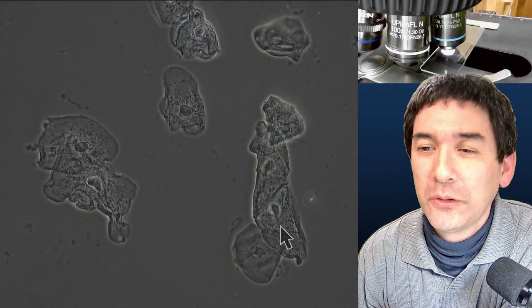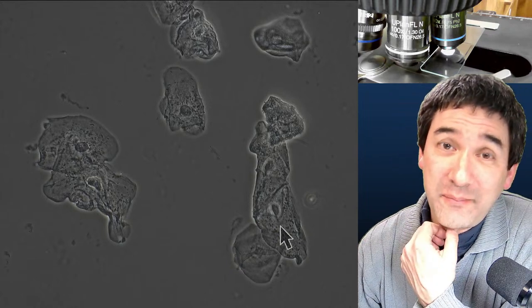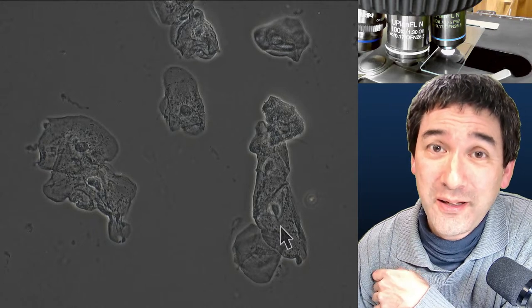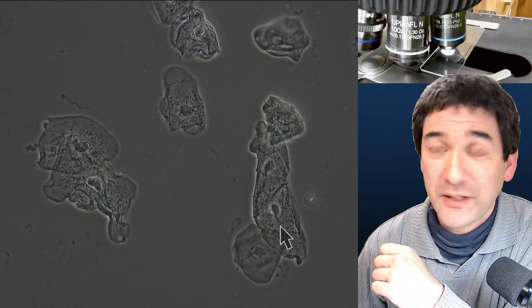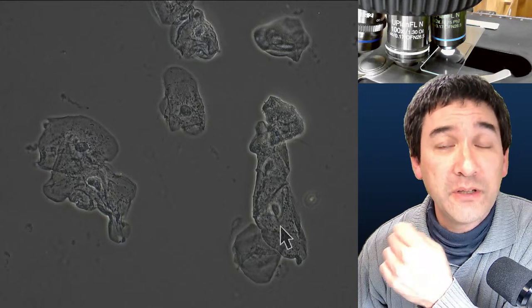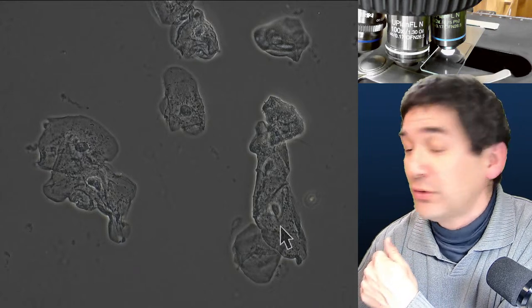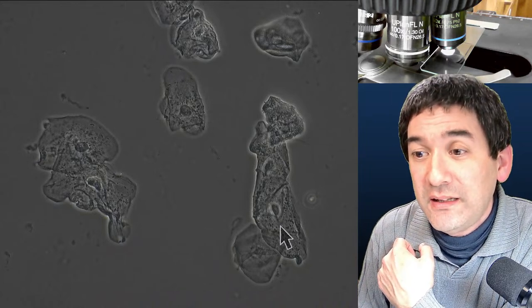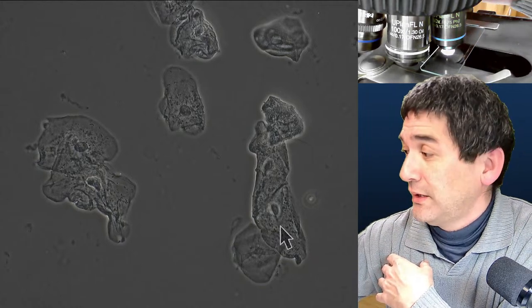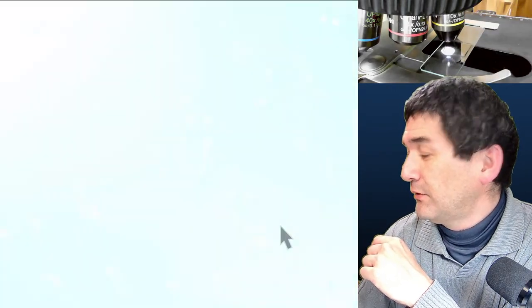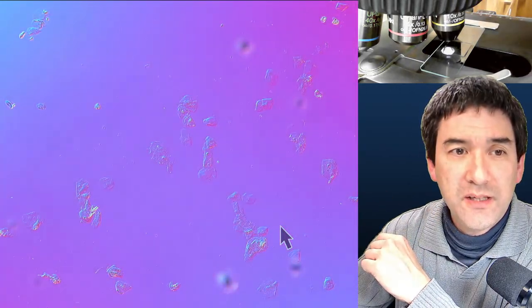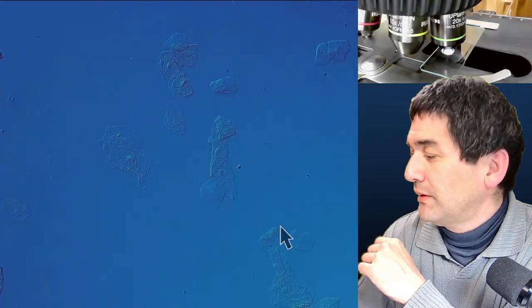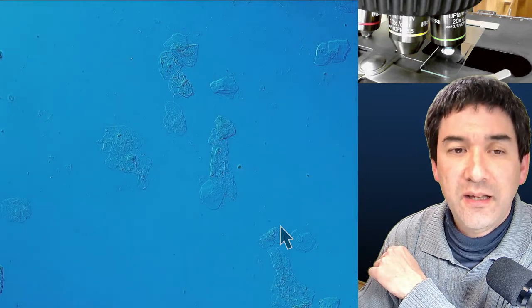Floating cover glasses are annoying. Dark field would look nice here too, but I currently don't have a dark field patch stop installed in my condenser. Now let's also look at how these cells appear in DIC for comparison — I engage DIC and have to switch the prism. We can also do a color play with DIC.